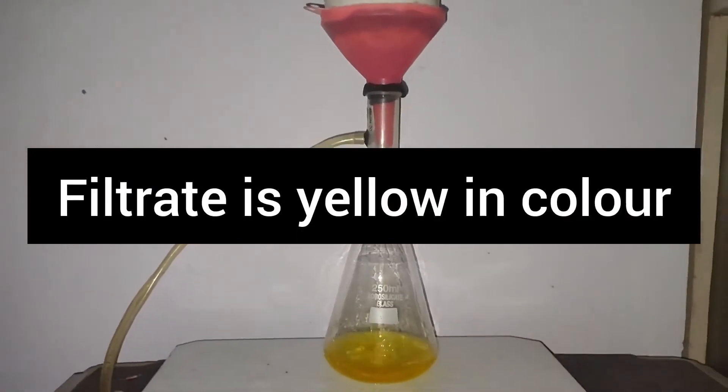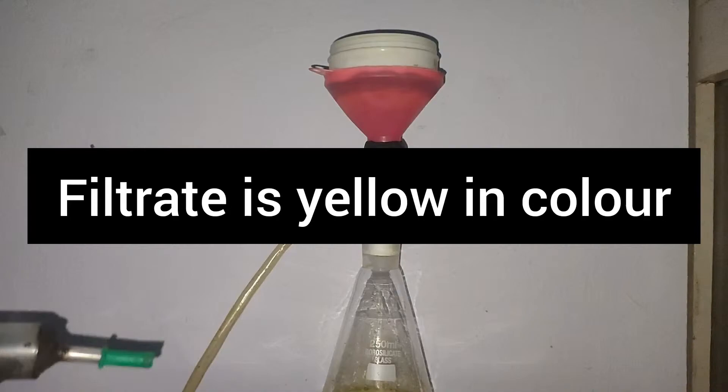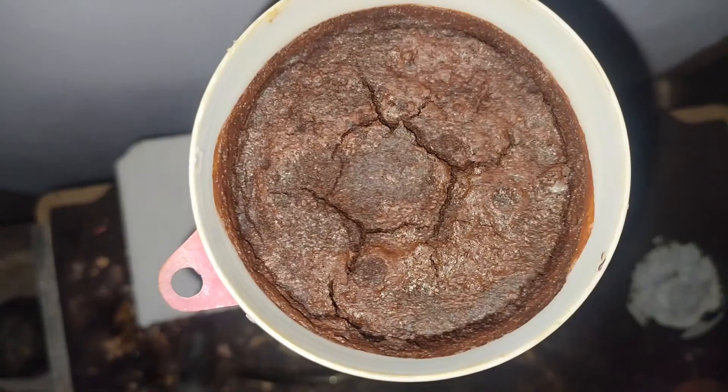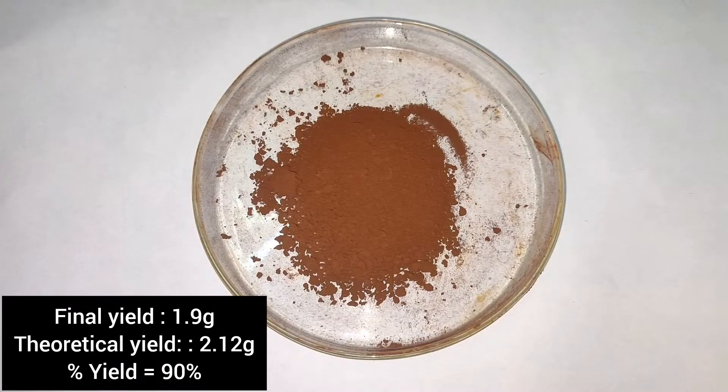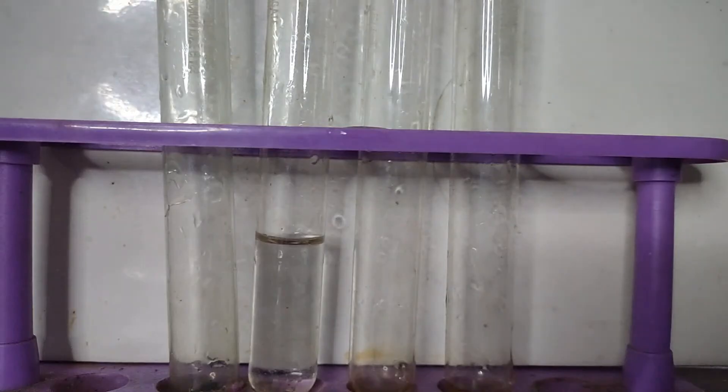The precipitate is washed a couple of times with distilled water, and the filtrate is yellow in color. Here is the dye. After drying, the final yield came out to be 1.9g which corresponds to 90% yield.